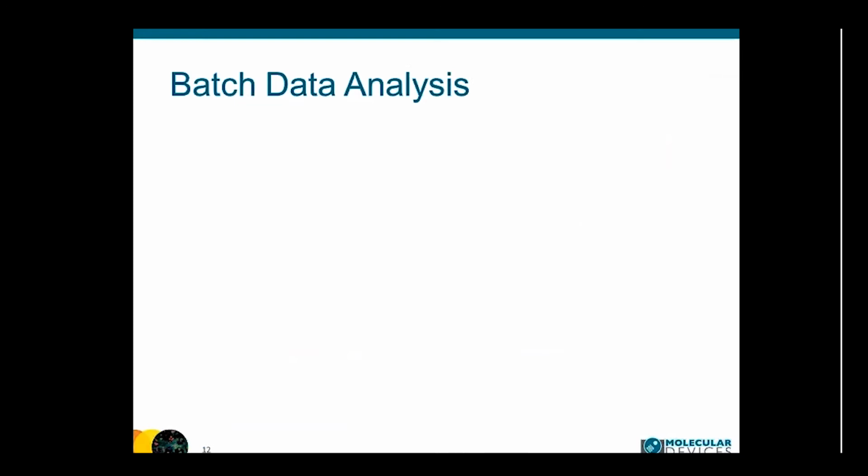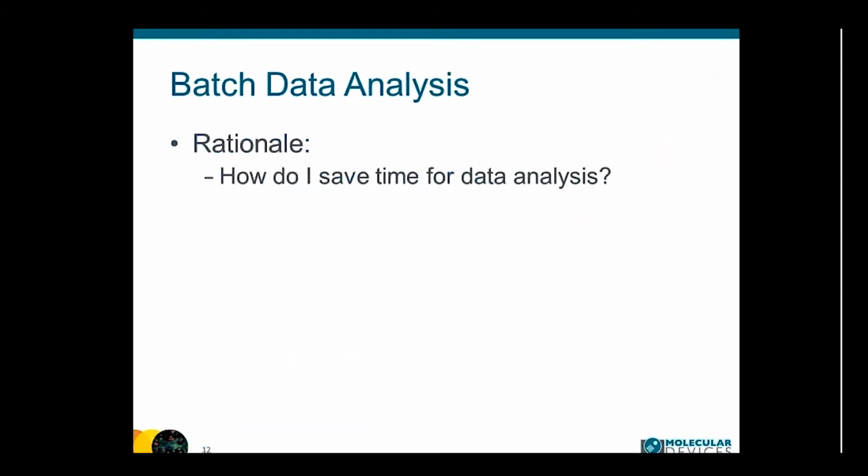Next one, I would like to say another hero feature is called batch data analysis. Now, why are we doing this? Because we've been listening to all of you. How do I save the time for data analysis? Some of you said that I spend a whole day or half day on Saturday to analyze the data acquired from Monday to Friday.